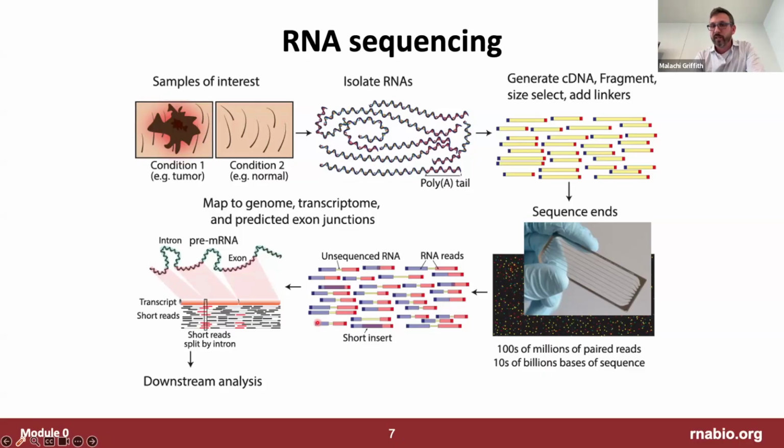cDNA sequenced. And if the fragment is small enough and the read lengths are long enough, the 2 reads will meet in the middle, essentially resequencing that whole fragment. If the fragment is really short, the 2 reads might just be identical, but reverse complements of each other. And if the fragment is a bit bigger, there might be a little space in between the 2 reads where we have a chunk of cDNA that wasn't sequenced at all and remains unknown.